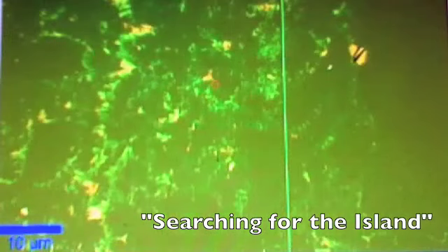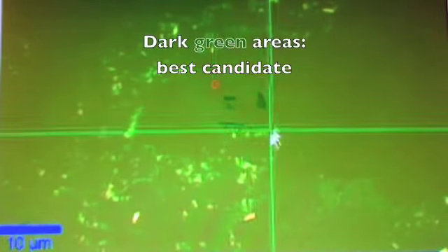Most of the stuff you see on the screen is tape residue. Graphene can be distinguished by its sharp edges. It typically takes a long time to find a suitable sample. Here, we have sped up and skipped hours of diligent work for your viewing pleasure. The dark green areas are probably the best candidates for graphene.